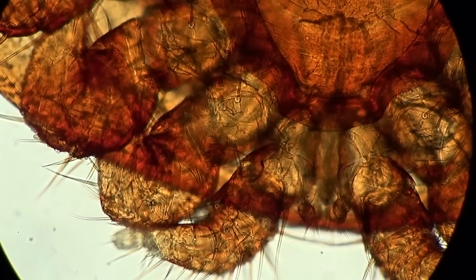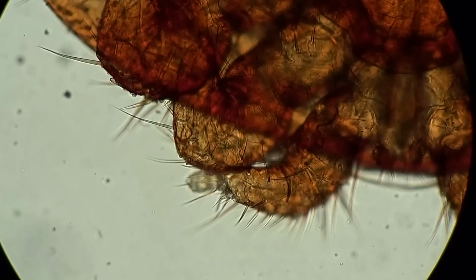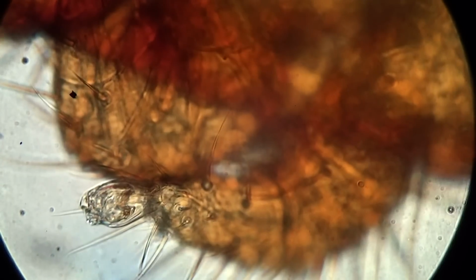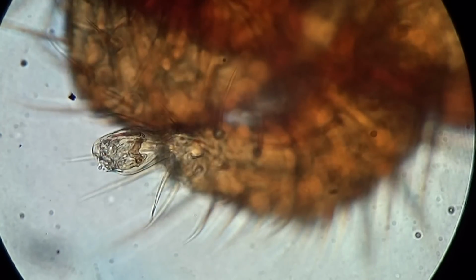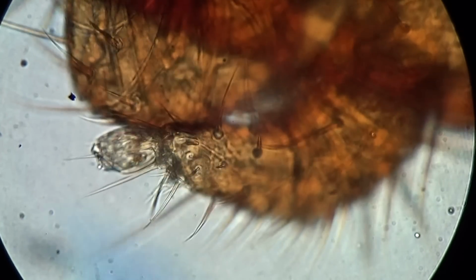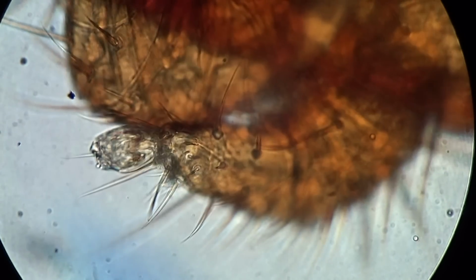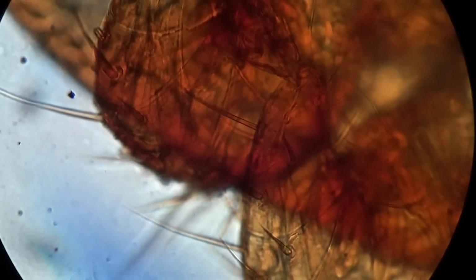On the top of a leg you will see just an enlargement, a small transparent enlargement. I will increase the magnification. Well, that's all. This is the pulvilla, which allows it to attach to the body of the host. So this is a special arrangement for attachment on the body of the honeybee, larva, pupa or adult.